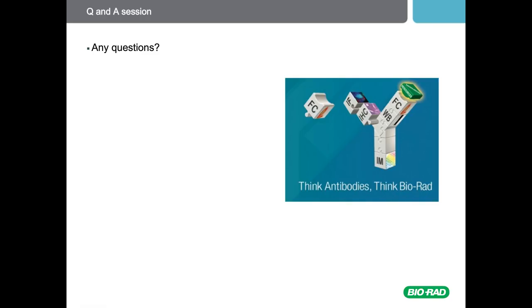And also, we've been asked, will washing and spinning remove your cell debris? Well, this will remove some of your cell debris, but it may be best, if you have a lot of cell debris, to either Ficoll your sample again, or you can gate out the cell debris using the threshold on the forward scatter, and that will help you to resolve your actual cell population.